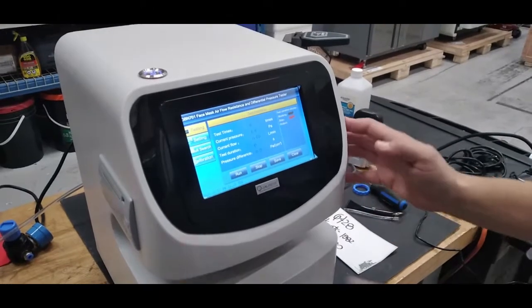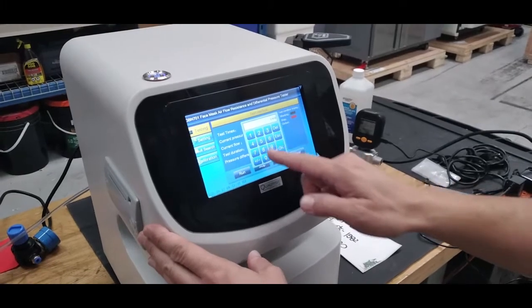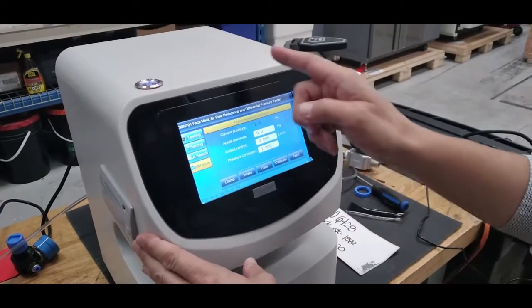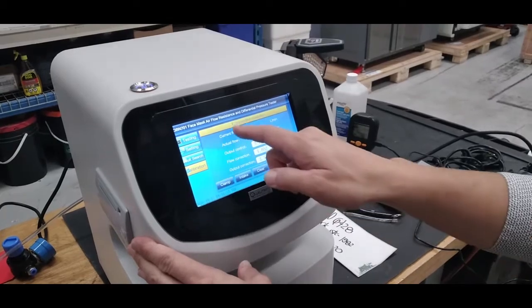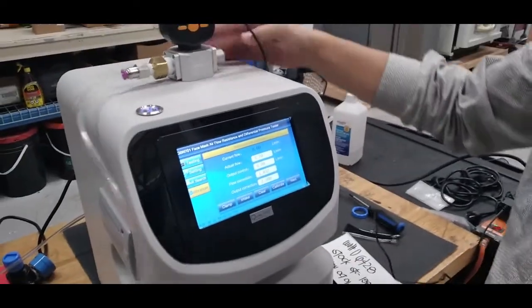Power on the machine and enter the calibration interface using code 1598. Once in the calibration interface, we're going to do the flow calibration first. Press next to reach the flow controller calibration screen.